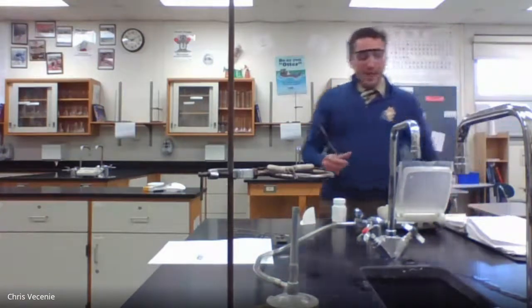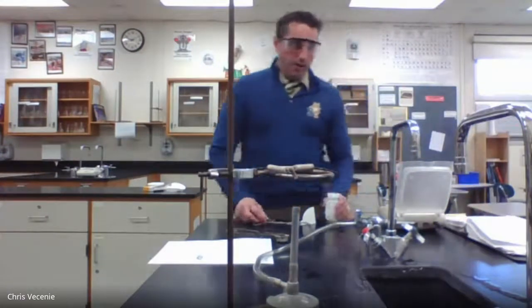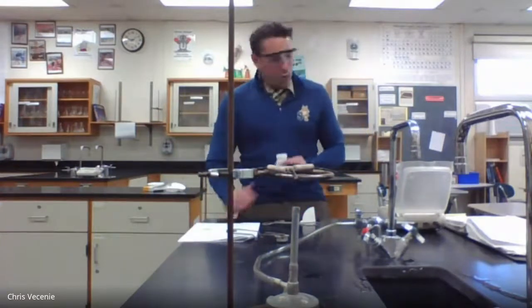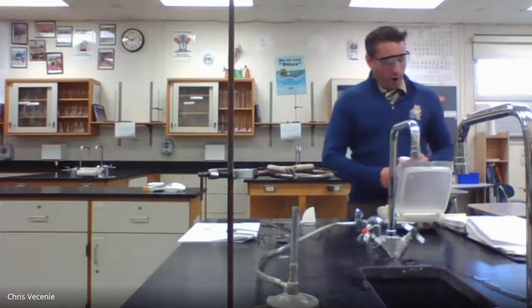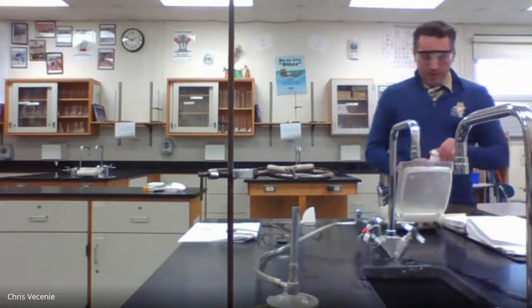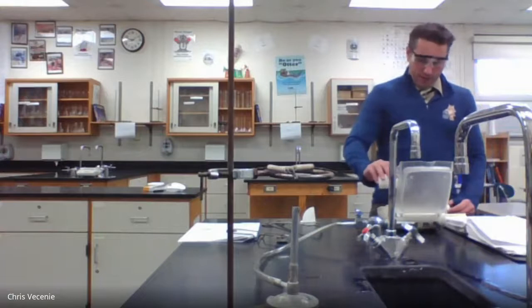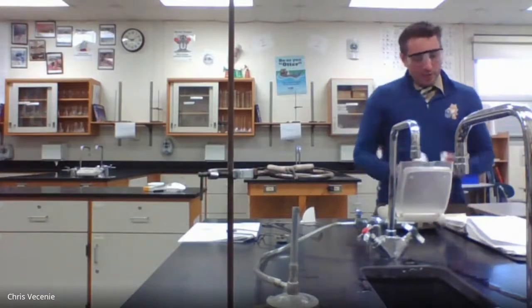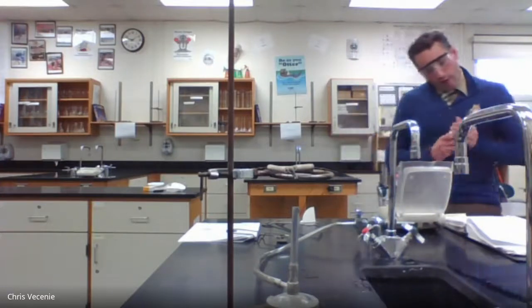All right, now it says while that's still on there, I want to add approximately 2 grams of the unknown carbonate. Okay, so I'm going to go ahead and do that. It doesn't have to be perfect, because we're just going to measure the crucible before and after to get exactly what's in there. All right, so I got it in the ballpark there.